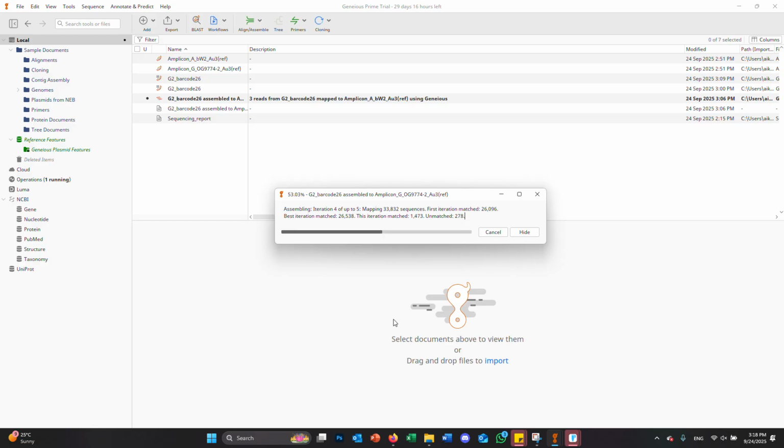I just want to ask a favour and give a thanks. I want to thank you for your involvement in testing out this protocol. We've shown that it works. We've shown that we can detect new isolates, though we have learned that it's best if all the amplicons get sequenced, because then the automated pipeline will be more forthcoming. But we can still analyse the data in the way we have today.